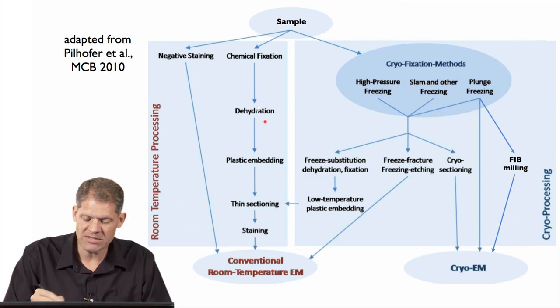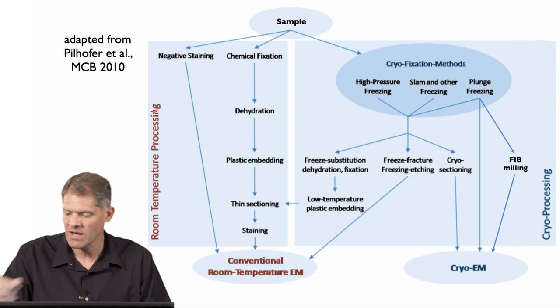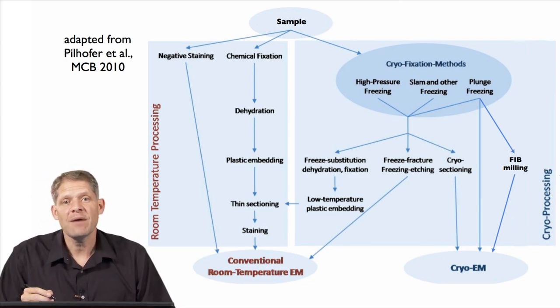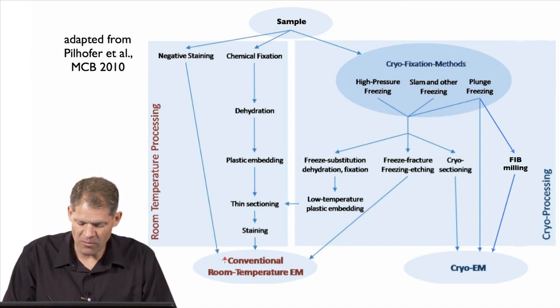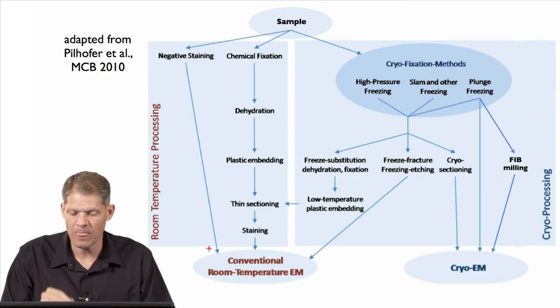Then we further classify the techniques as whether they happen here. These are processes that occur at room temperature, so this is room temperature processing. And these steps all happen at very cold temperatures, so we'll call those cryoprocessing. So perhaps the simplest path is to start with a sample and simply add a drop of negative stain and let it dry. This produces a room temperature sample ready for microscopy.